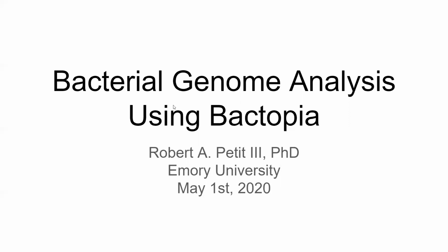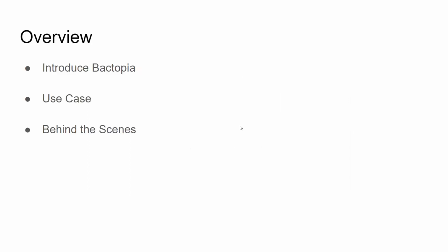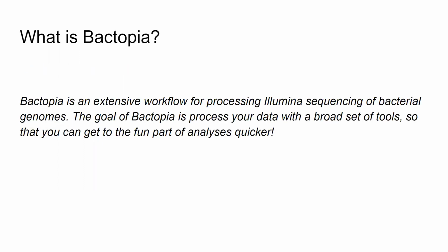So yeah, I've titled this talk Bacterial Genome Analysis using Bactopia. Briefly, I'm just going to introduce Bactopia, present a use case, and then give some behind the scenes of what's happening in the background that you don't really get to see in the papers and whatnot.